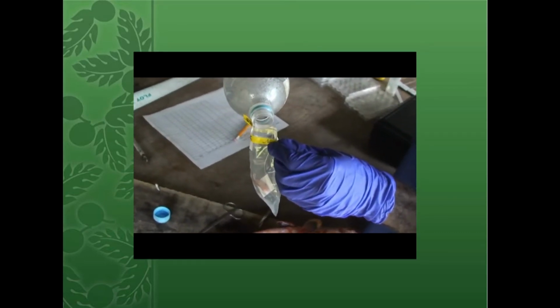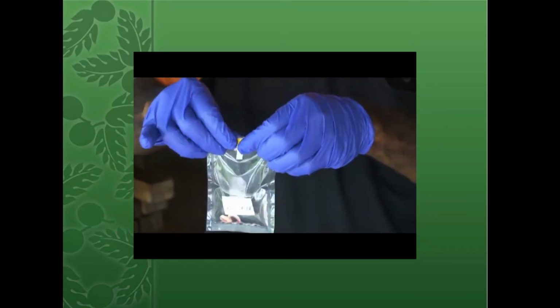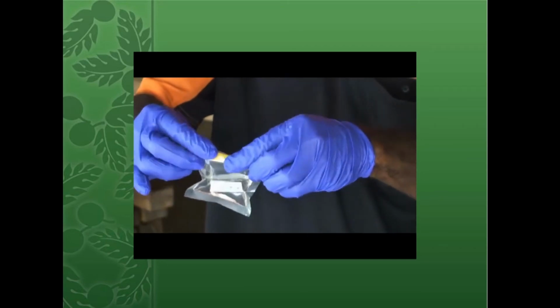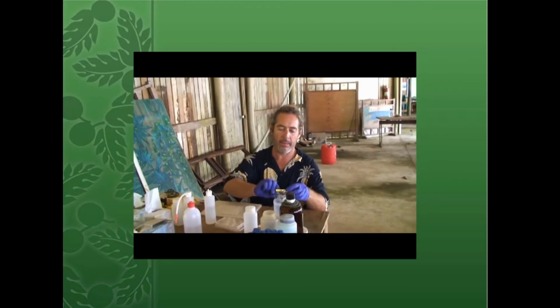The first thing you'll do is subsample whole gonads. Just to remind you where those gonad samples came from, we're going to step back 1 or 2 steps to the point in whole specimen processing where the gonads have been placed into a sample bag and fixed. Wait at least 24 hours for that fixative to work, and remove the gonads and the tag from the bag.